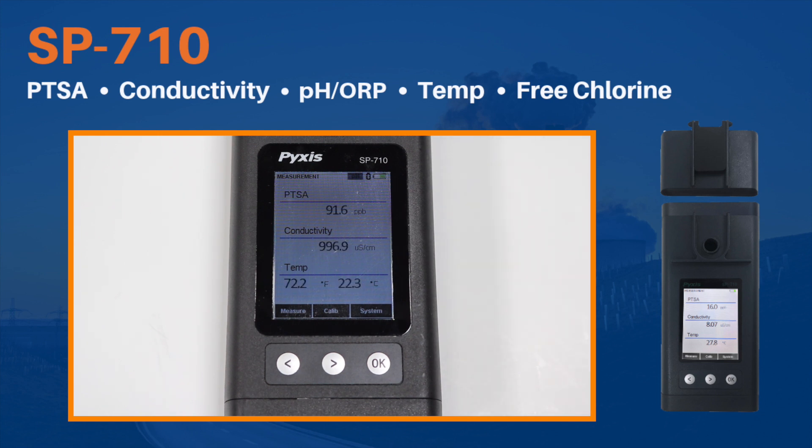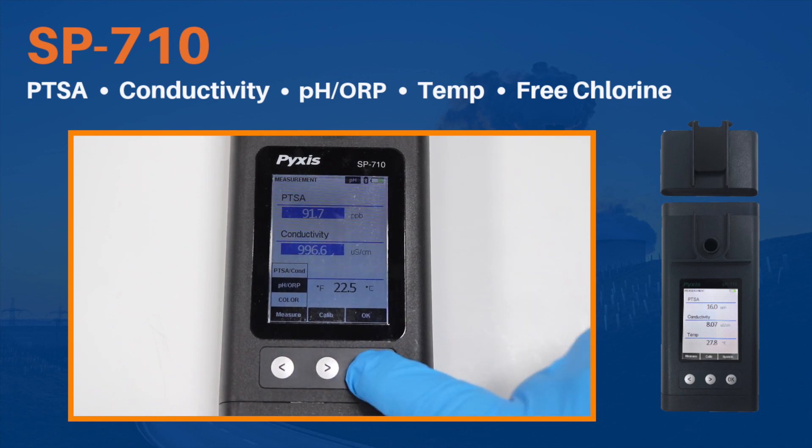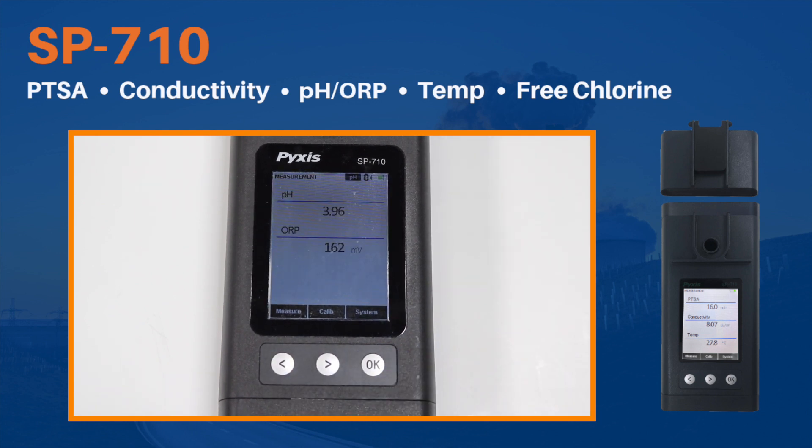The SP-710 is designed for cooling water fluorescent-traced applications, capable of measuring pH, ORP, temperature, conductivity, PTSA tracer, and colorimetric free chlorine.